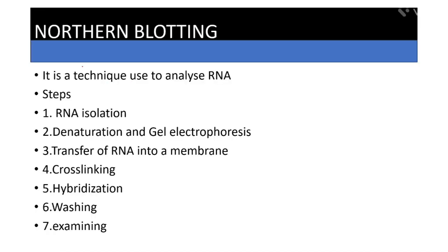In this video we are going to discuss what is northern blotting. Northern blotting is a technique which we use to examine RNA. These are the 7 steps involved in northern blotting, starting from RNA isolation to examining.